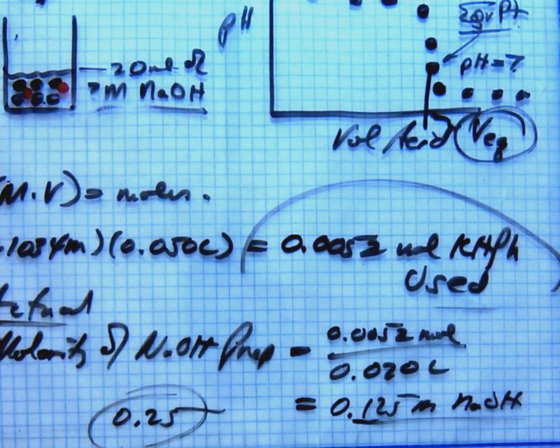Sorry about that. The volume of KHP added, I just chose it, okay? Now it's really going to come out close to your 0.25 when you finish with it. It really will. And it'll probably take more than 50 mils if you did that one anyway. But that's the objective here of you being a decent chemist.